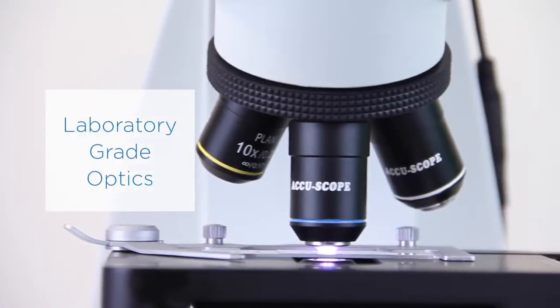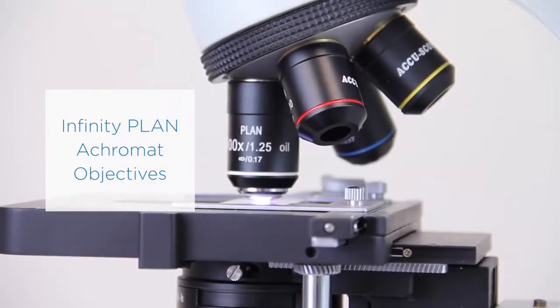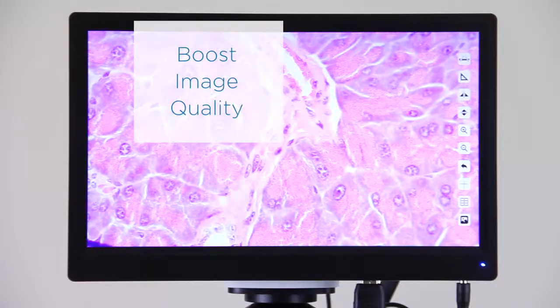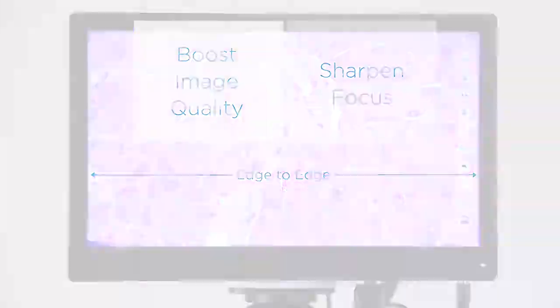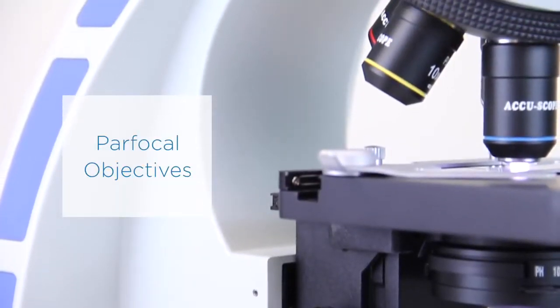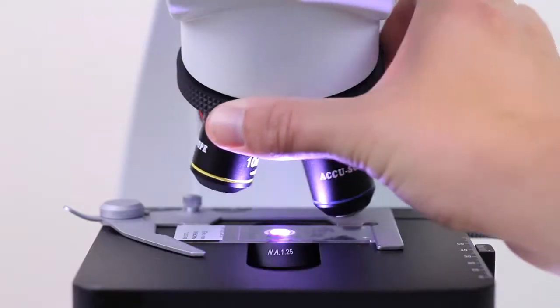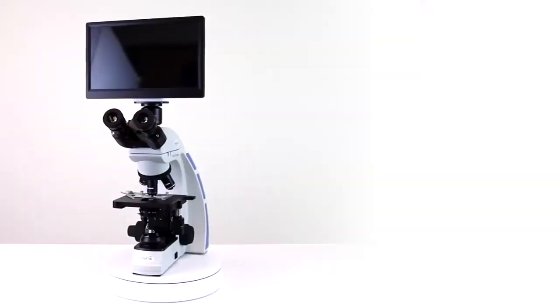The laboratory-grade optics offer infinity plan achromatic objectives that boost image quality and sharpen focus from edge to edge. And with the parfocal objectives, you'll never have to refocus after changing magnification again.